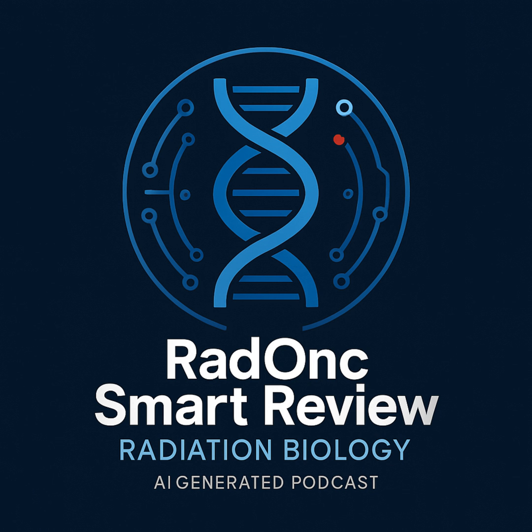Which is where the in vivo assays come in, studying this within a living system. Exactly, in vivo. And people like Withers and his group did some really groundbreaking, clever work developing assays to quantify clonogenic survival right inside the animal, often focusing on stem cells in normal tissues because their survival is key for tissue recovery after radiation. Let's talk about some of those key in vivo assays for normal tissues. One of the earliest, really historically important ones is the spleen colony assay.